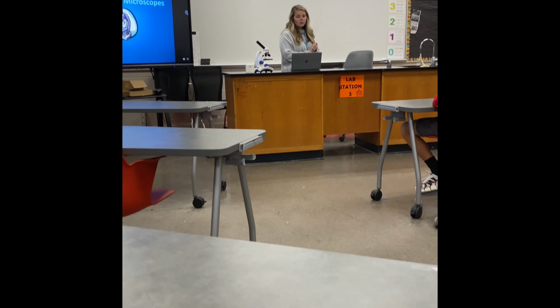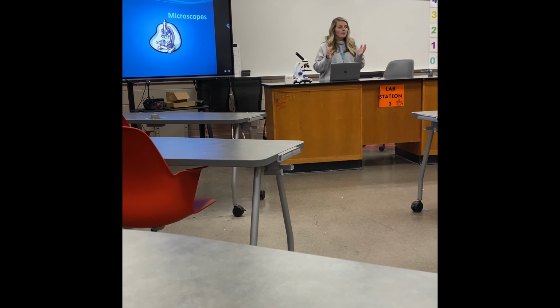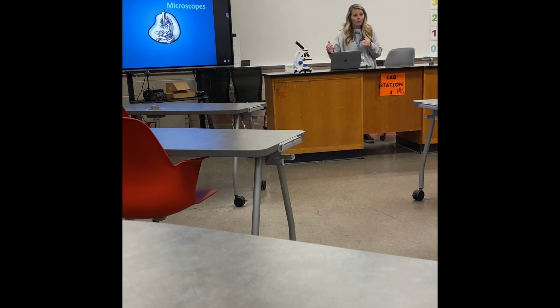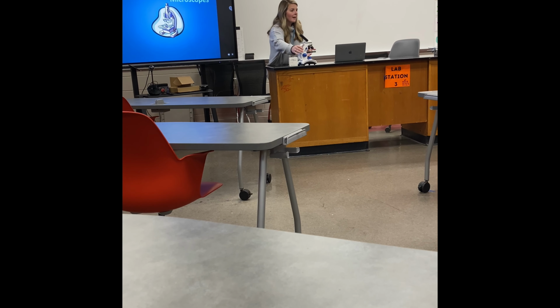And I also want you to know the difference between a prokaryotic cell and a eukaryotic cell, okay? That's really, really pivotal in our next content that we're going to do, hopefully at the end of this week, okay? So, to begin with, let's talk a little bit about microscope handling and microscope safety, okay?